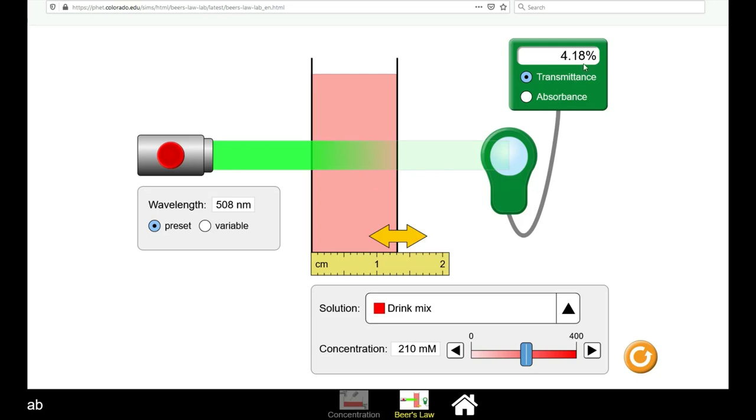You can then see the percent transmittance, that is, the percentage of light that is transmitted through to the other side of the solution. All of the other light was blocked or absorbed by the solution.